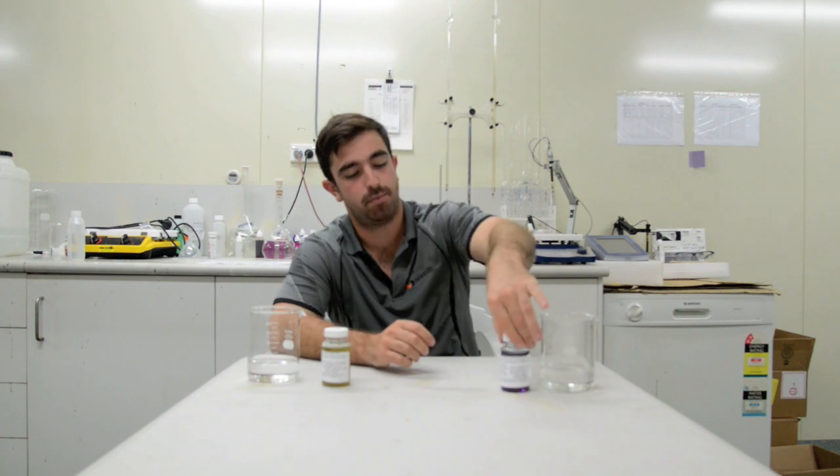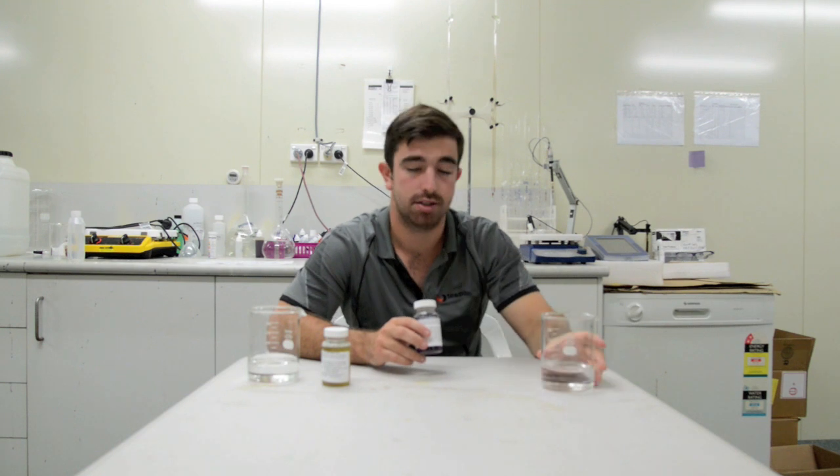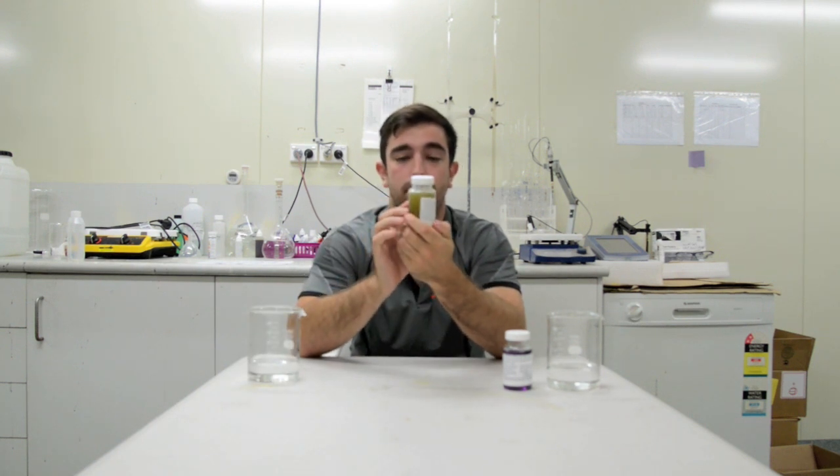After 48 hours, we have a purple result, which is a negative result, showing there's no coliform bacteria in this water supply. Our other water supply, on the other hand, is yellow. Yellow is a positive result for coliform bacteria.